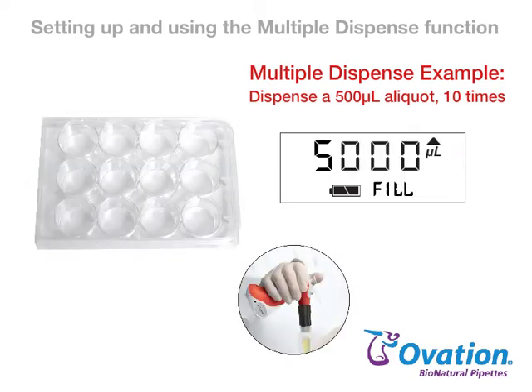Aspirate sample by pressing and releasing the pipetting trigger. The total volume required to complete all dispenses is displayed while the volume is being aspirated.